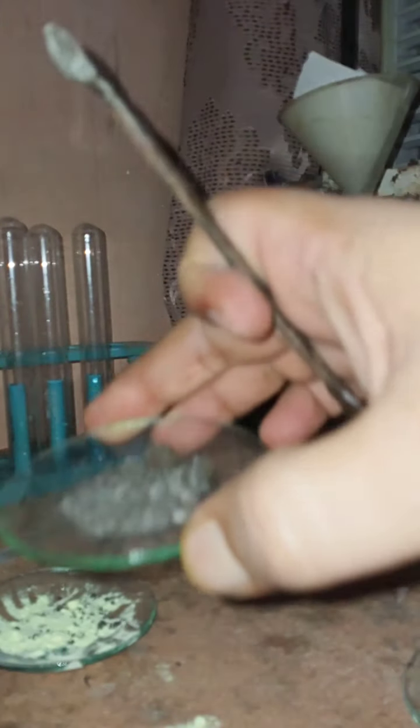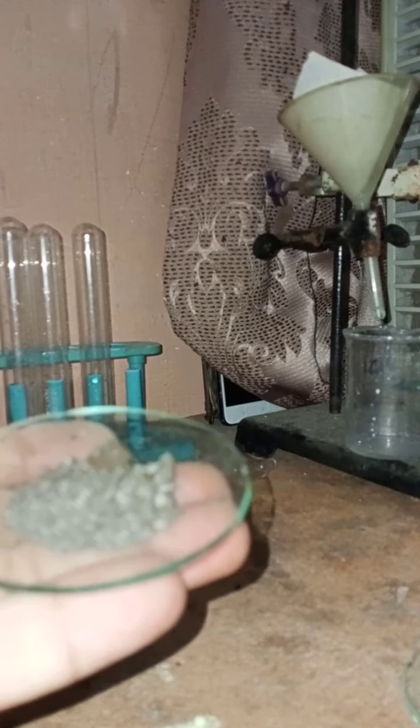I have mixed these two substances, but this mixture I am going to heat up to red hot. We should not waste our time in heating, so I cannot show you that, but I have shown you this. This is the kind of substance that is produced when we heat the mixture.